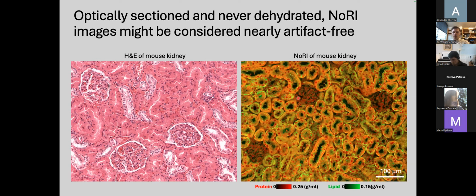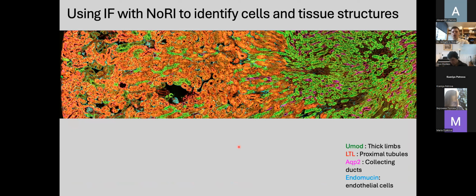So as a first look, this is a much cleaner, non-disruptive form of microscopy, and we get absolute readouts of important biological readouts from this. I wanted to show you what we've been able to do with it in the last year. We've really developed this from single cells to being able to image whole organs. For instance, here you'll see a kidney from a mouse, and this is an entire cross-section of a kidney.